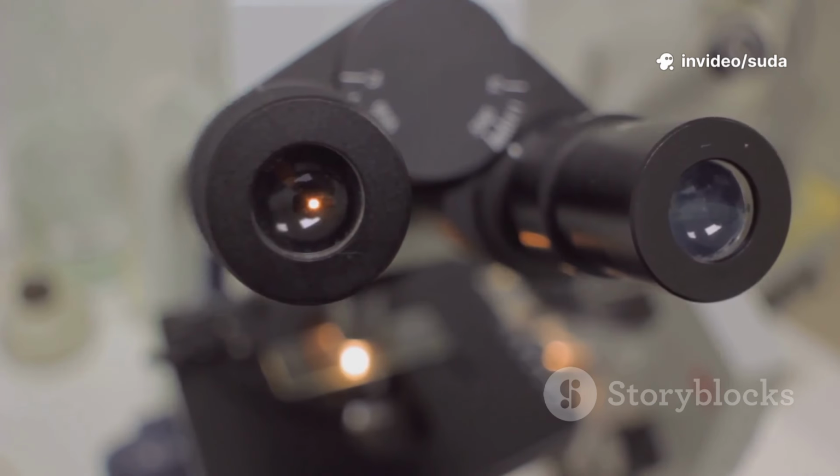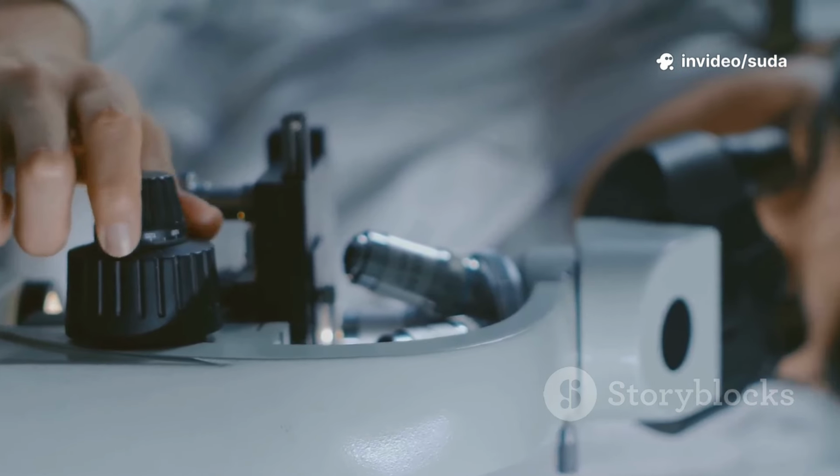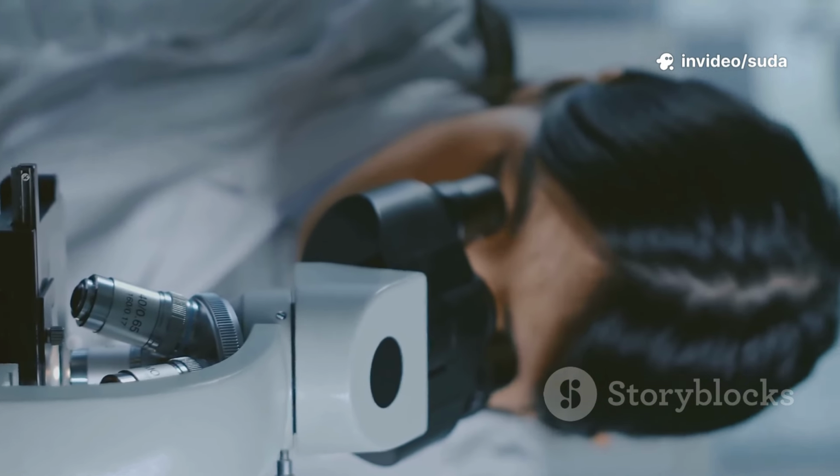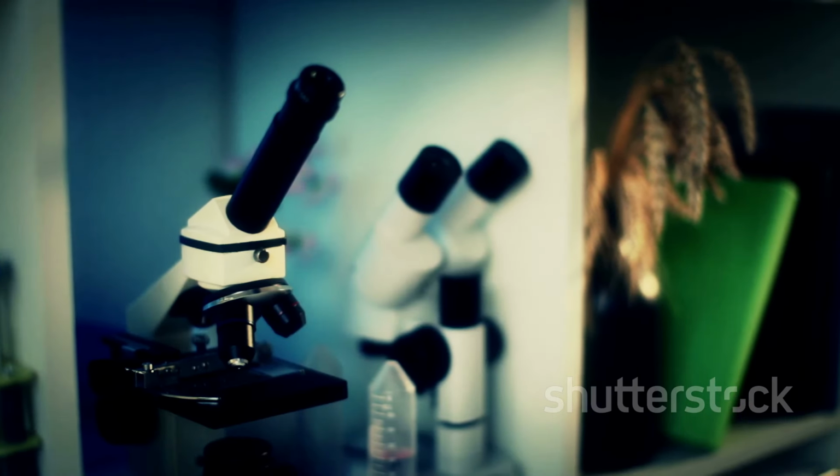The diaphragm controls how much light gets through. Two focus knobs, coarse for big moves, fine for tiny adjustments. Carry by the arm. The base keeps everything stable.